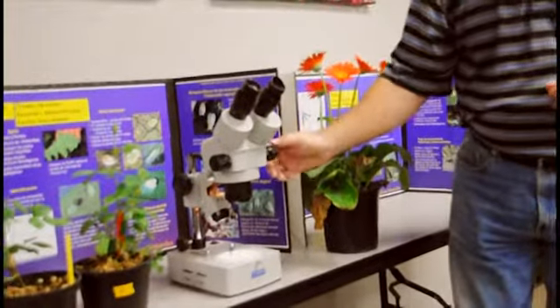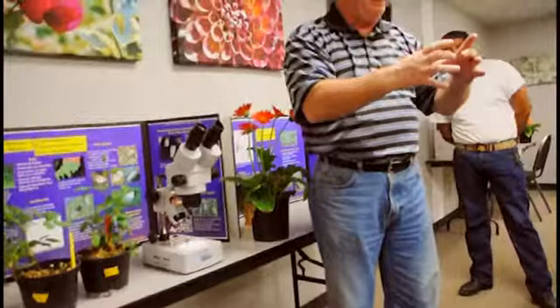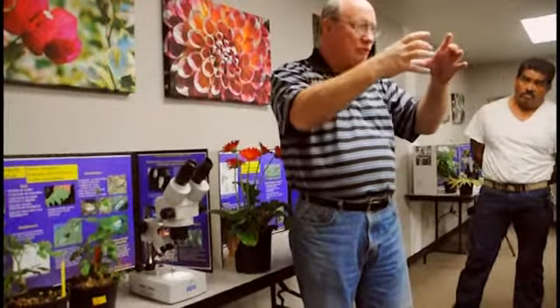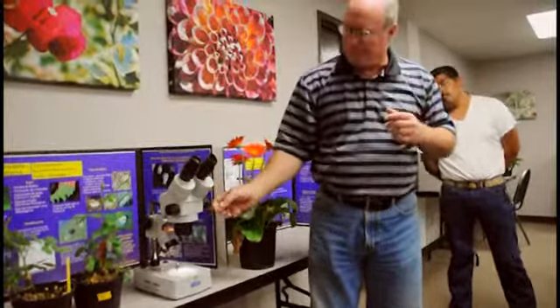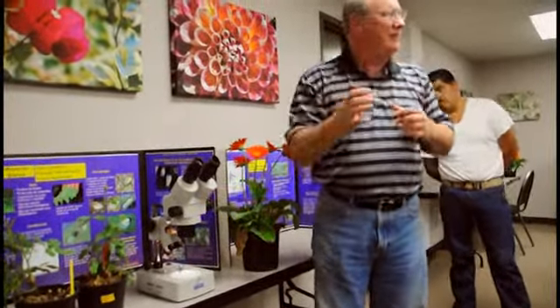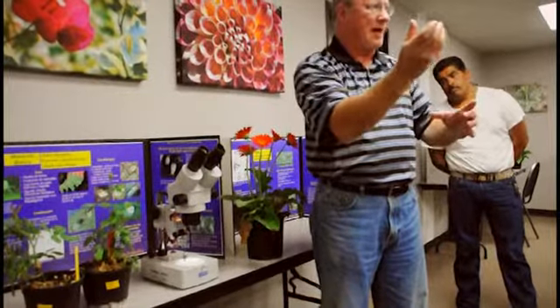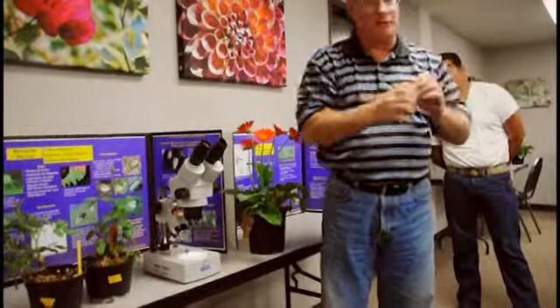The next thing is this dial right here, so you can zoom in on an image. If you have a big surface, and you see a lot in the picture, you can zoom down to just the insect using this knob right here. Now, some microscopes will have a dial here that does the same thing, but it doesn't always zoom. It's one image, two images, three images, so it dials to just three things. This one zooms into the image, okay?